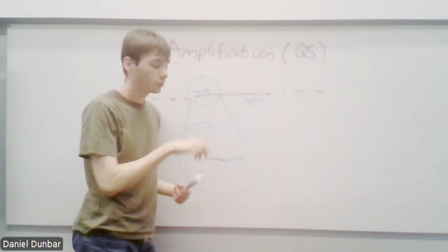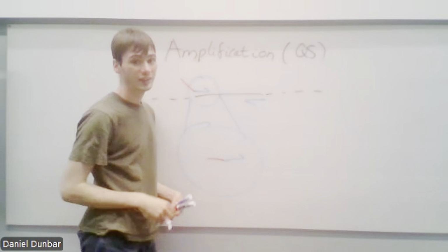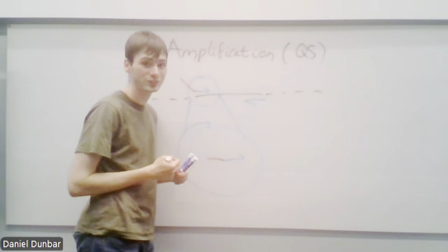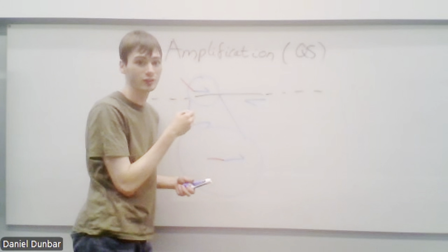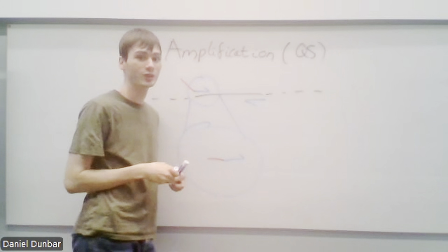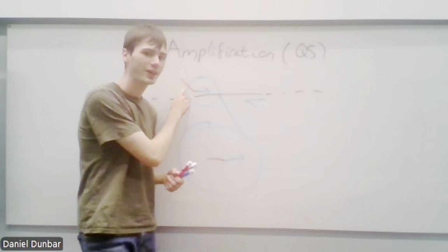So what this actually looks like on the genomic DNA is the rest of it just sits up there. And when you run the PCR, as it's running, this bit then starts to get amplification onto it as well. So all your amplified bits have that extra bit.